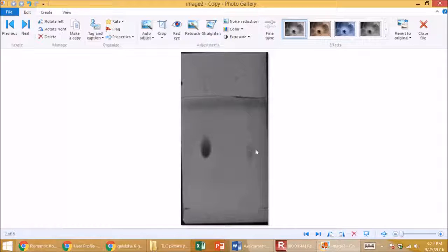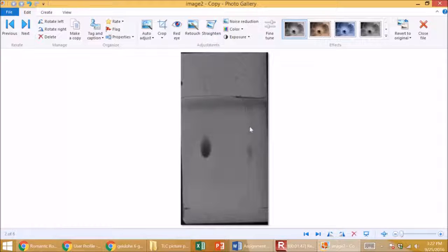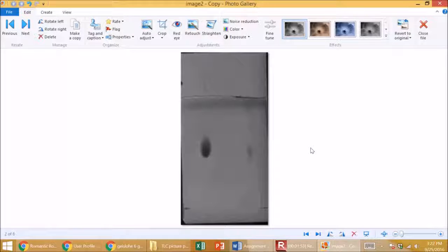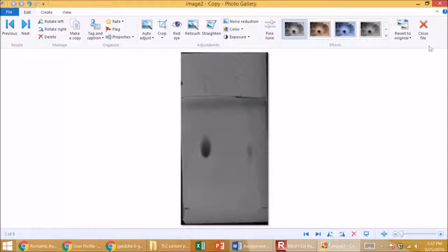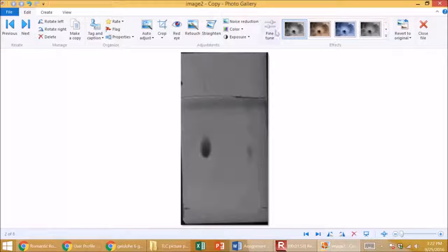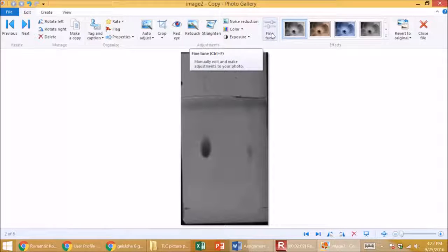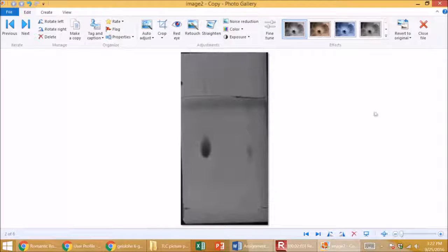This spot is probably the same as that, and you can see there are some shadows here that may be other molecules. So I recommend this as a way to print your TLC photos, because black and white will print better. If you wanted to fine-tune it, I'm sure you can make it look a little better, but this is a good start.